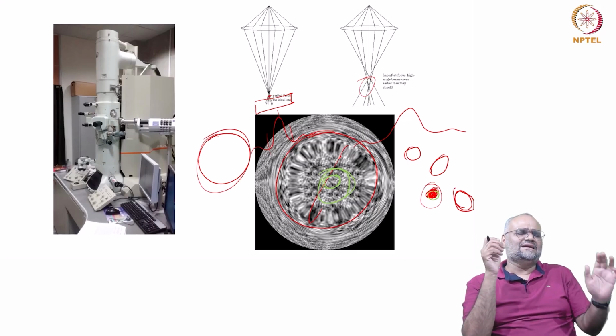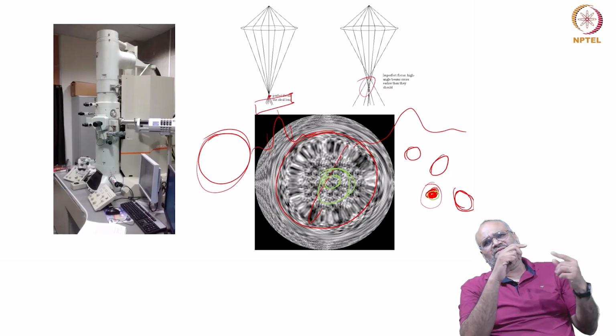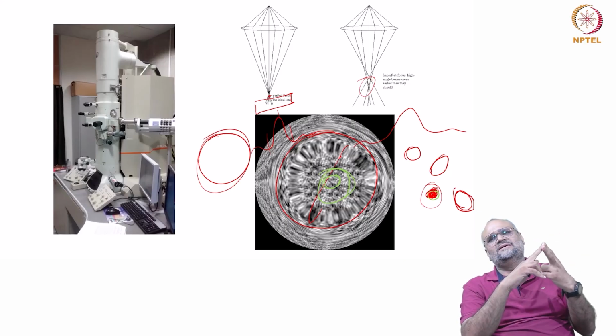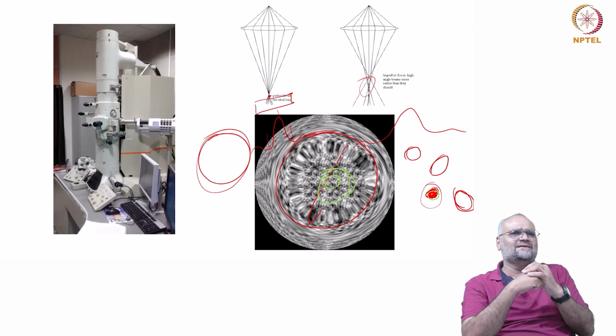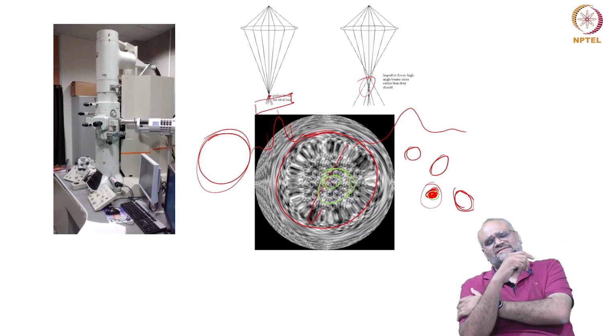So to cut this long story short, when I want to image in STEM mode, I have to switch to the STEM mode, do some corrections with the probe, and then insert the aperture. These corrections of the probe involve condenser stigmatism correction, and then I insert the aperture, and then I start imaging while correcting the image contrast.